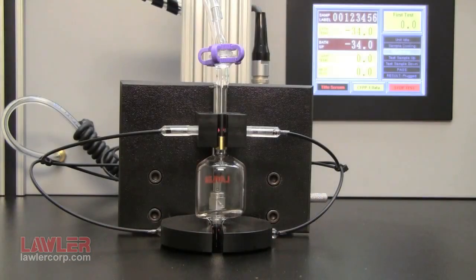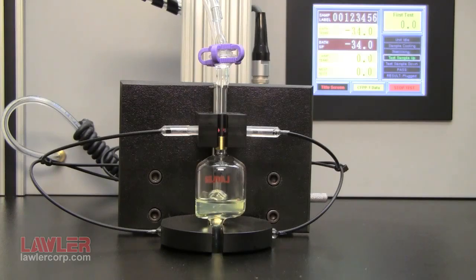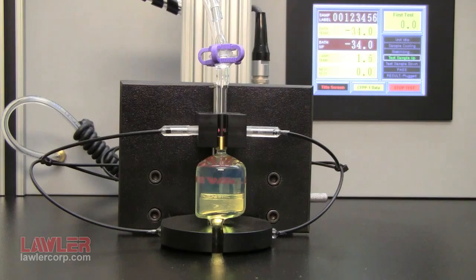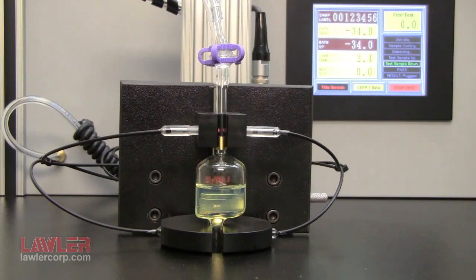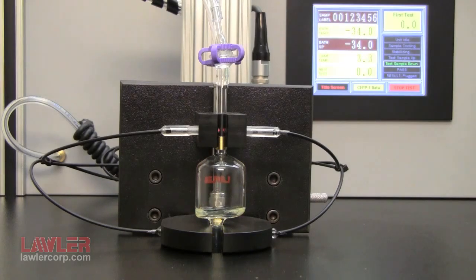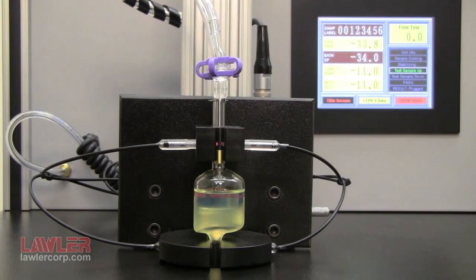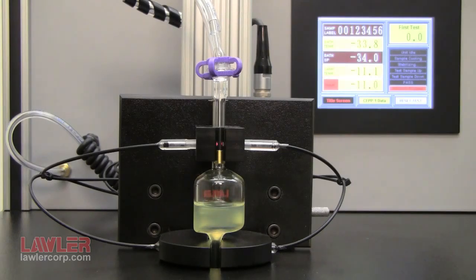The sample pulled under vacuum travels through the 45-micron filter held in a brass filter assembly into the pipette above the test jar. Optical sensors detect sample movement. The controller measures the time to fill the 20 milliliter pipette. Testing is repeated at each 1 degree C drop in sample temperature. The test ends when time exceeds 60 seconds, or sample fails to flow back into the test jar because of filter plugging.